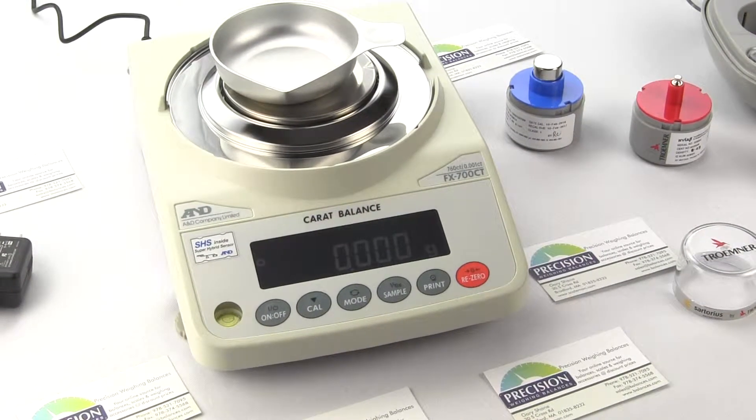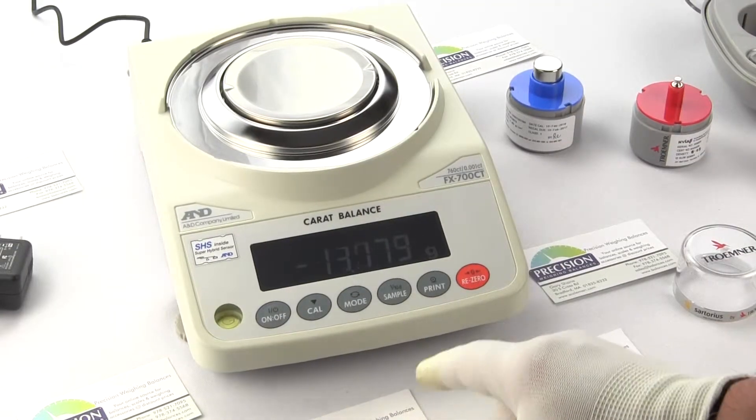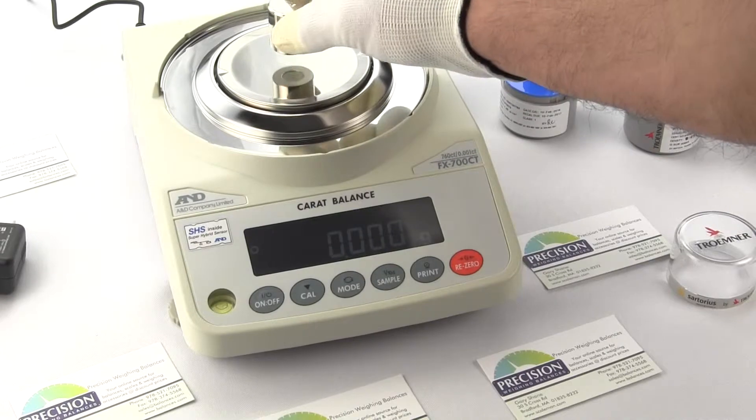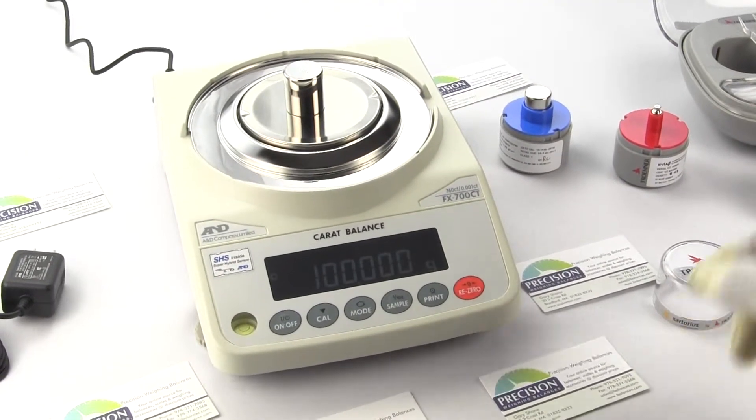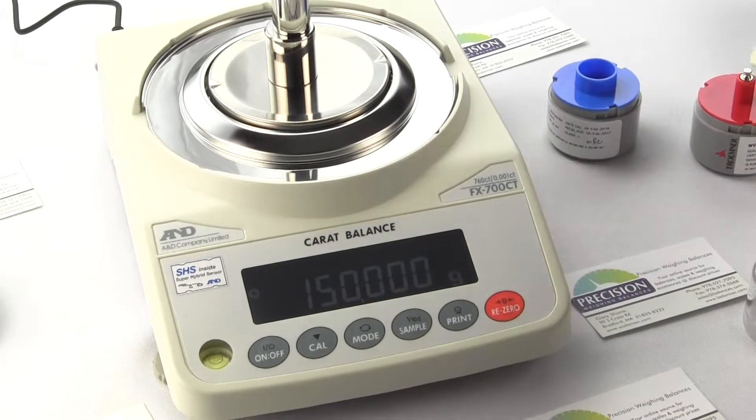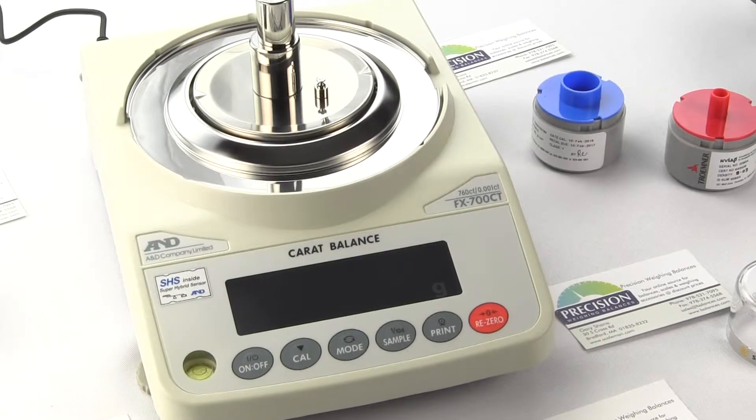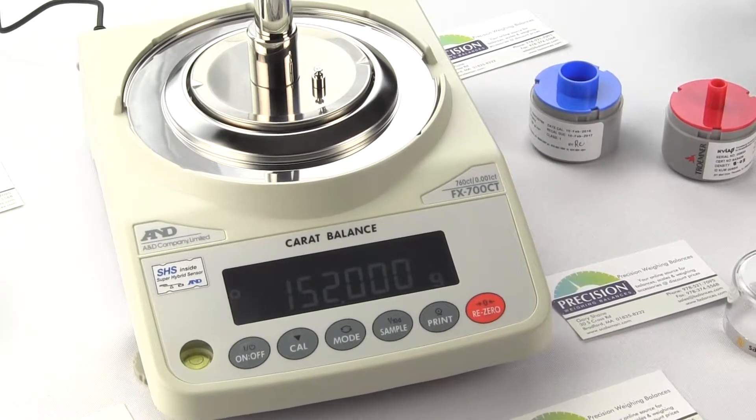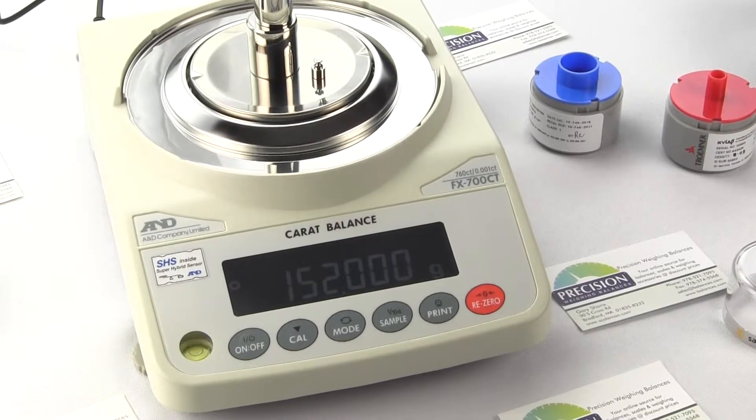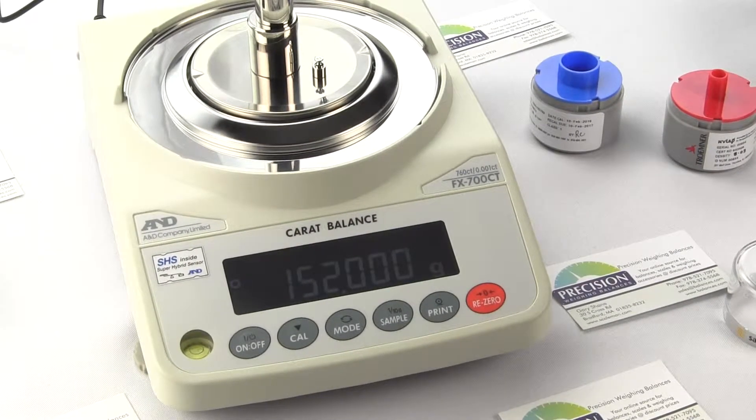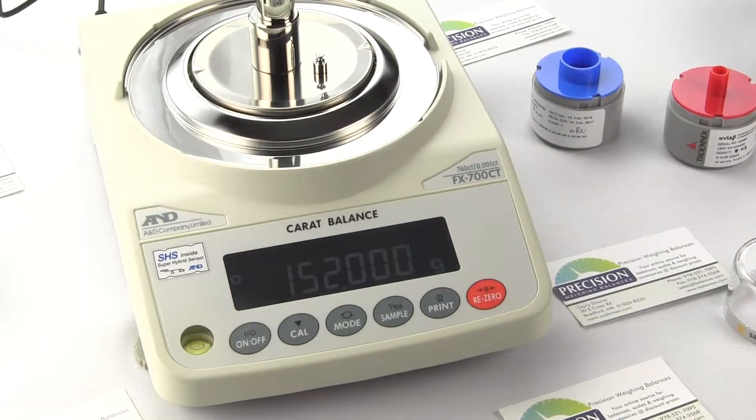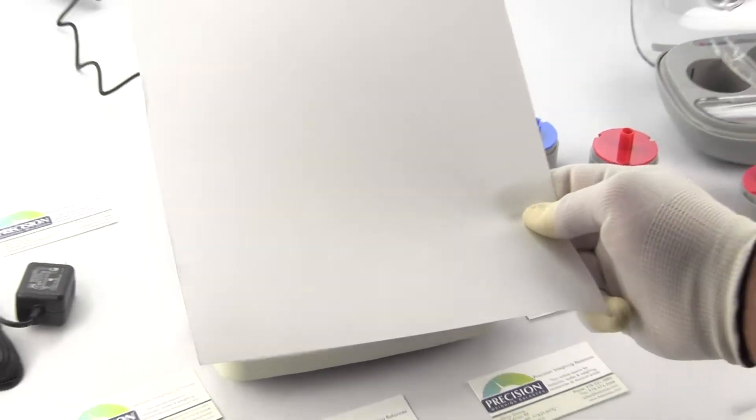The maximum weighing capacity in grams is 152 grams so this is a low capacity balance so we have some weights here this is 100 grams and then we have 50 and we do have a 2 gram weight and there you go. So you can see we're not even using the draft shield and the balance works excellent but the balance is designed for that draft shield. The compact footprint that's a big selling point with this balance the footprint of the balance is only 7.8 by 11.6 inches so that's smaller than this standard piece of paper. So again very small footprint saves a lot of valuable bench space.